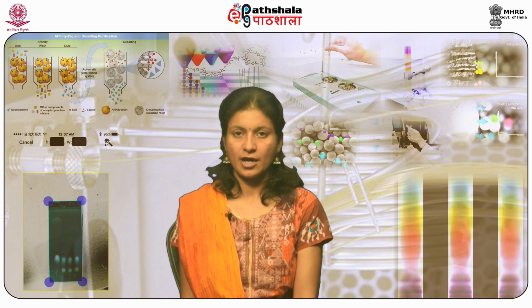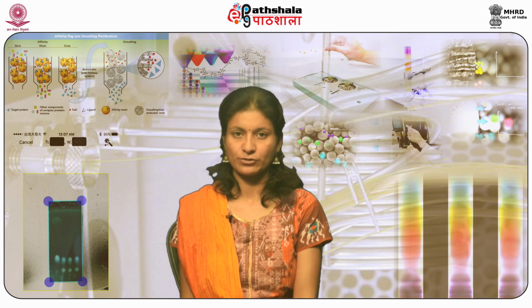Today we are going to discuss a module, gas chromatography applications, under chromatographic techniques.